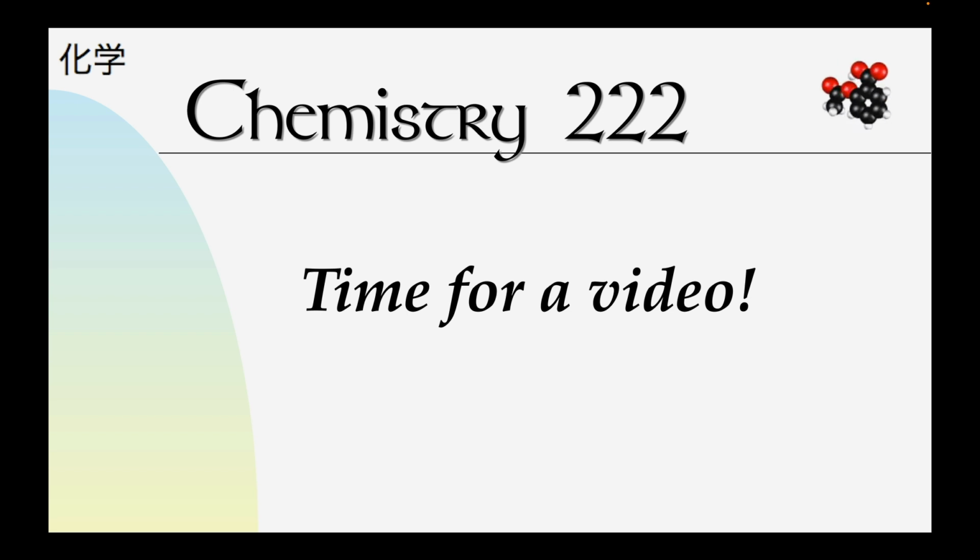On this lab, I just want to make a highlight. This is a lab where you must wear safety goggles at all times. So bring along a pair. If you have your own, that's awesome. I'll have some to borrow too. It's really important to keep your eyes protected. We'll have flames and all kinds of stuff coming off and chemicals in the air. It's just not a good lab to not have goggles, shall we say.